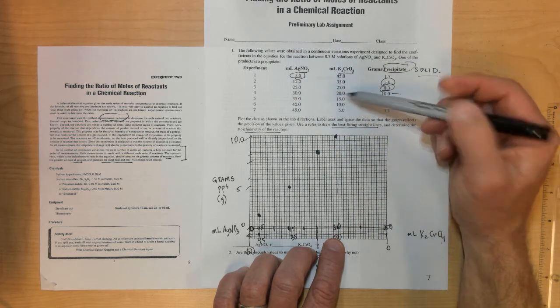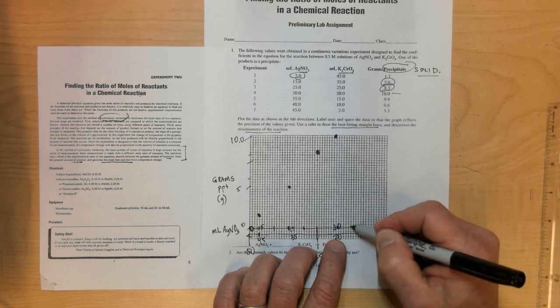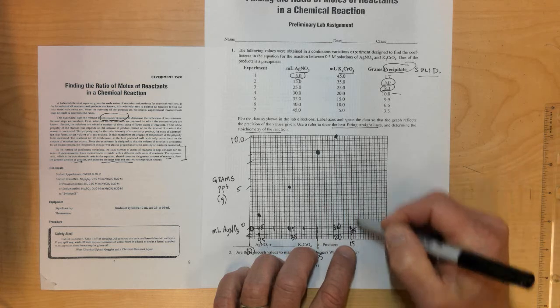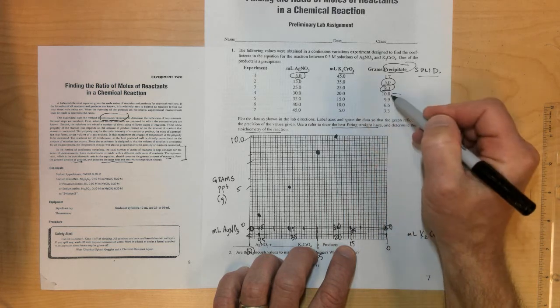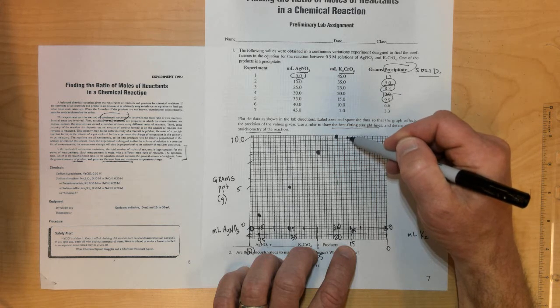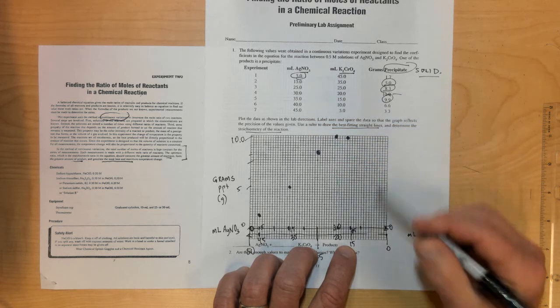And then at 35 and 15, so 35 would be right about here. That would be related to 15 of this. That would give me 9.9. So that gets me really close. It'd be like right up in here, 9.9, super close to right up there.